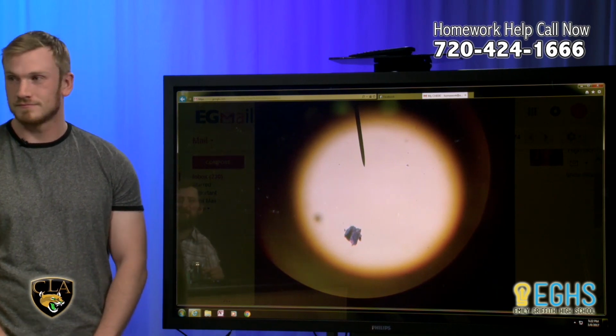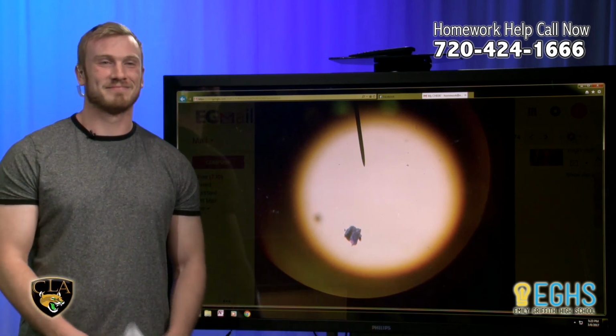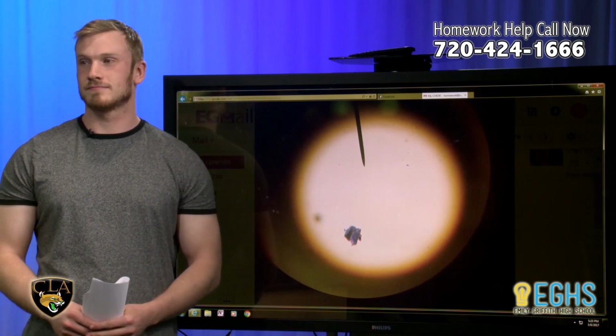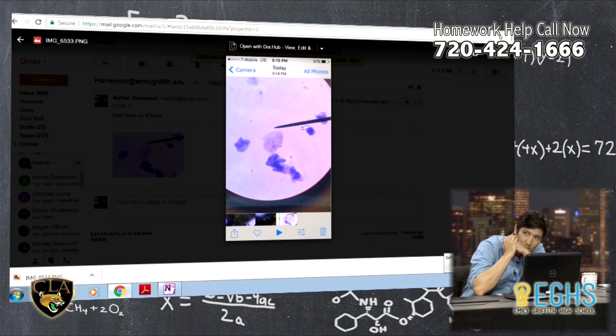If we could jump to Nate's screen, beautiful picture, Becca. Not to take anything away there. But Nate also took a picture. His came through in his own Gmail. And you can actually see the nuclei of the cells in his. Oh, his is way cooler. He has way more of them on there. You can see more of that; the darker places are where there's more tissue folded over. But that one cell right in the center, just below that centering needle, you can see the outline of the actual cell. You can see little dots inside that are different organelles, and you can see that large black or darker center. That's the nucleus of the cell. Nate's cheek cell contains all of Nate's DNA.